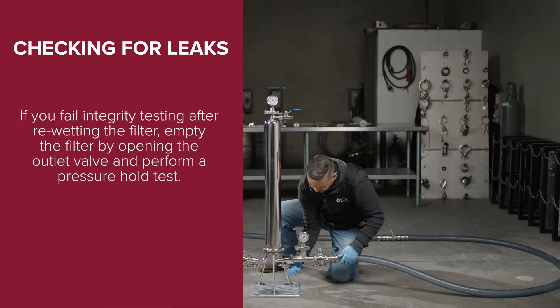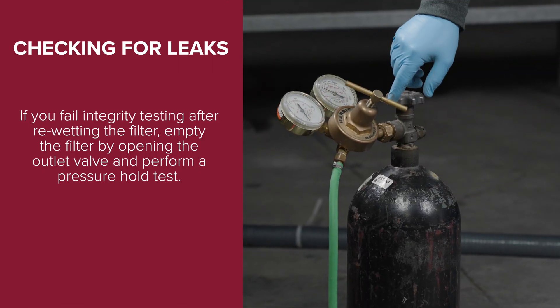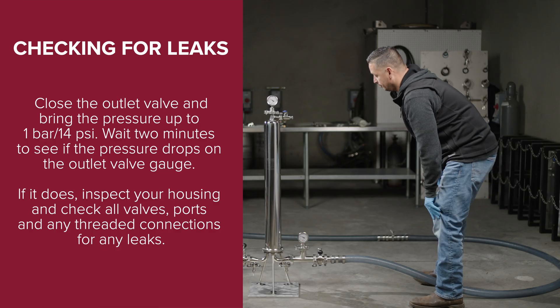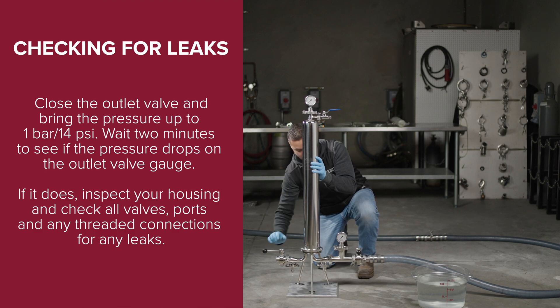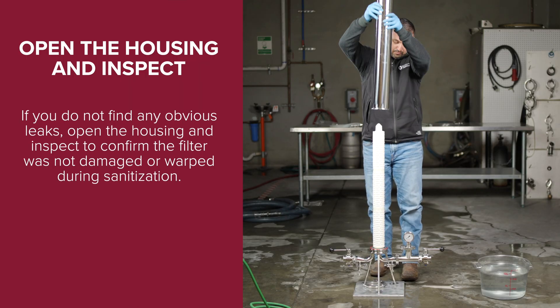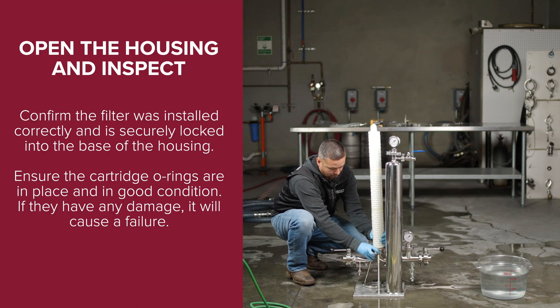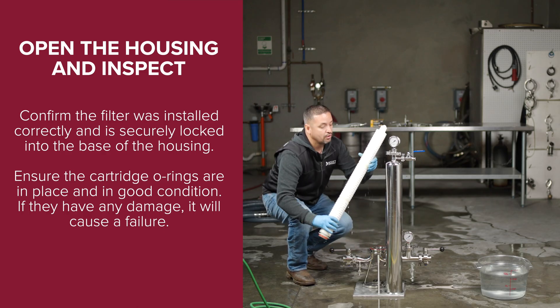Checking for leaks: if you fail the integrity test again after re-wetting the filter, empty the filter by opening the outlet valve and perform a pressure hold test. Close the outlet valve and bring the pressure up to 1 bar or 14 psi. Wait 2 minutes to see if the pressure drops on the outlet valve gauge. If it does, inspect your housing and check all valves, ports, and any threaded connections for leaks. If you do not find any obvious leaks, open the housing and inspect to confirm the filter was not damaged or warped during sanitization. Confirm the filter was installed correctly and is securely locked into the base of the housing. Ensure the cartridge O-rings are in place and in good condition — any damage will cause a failure.